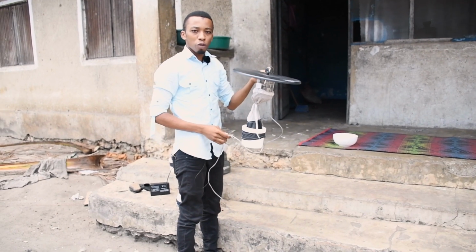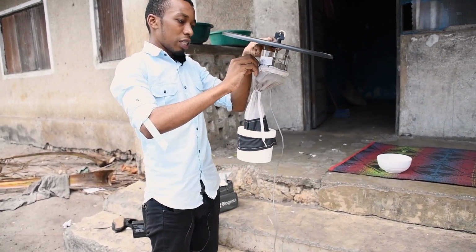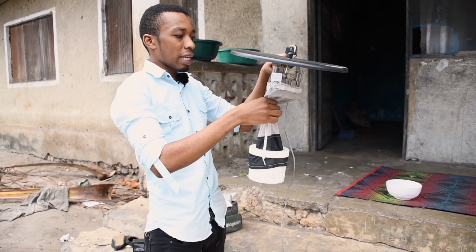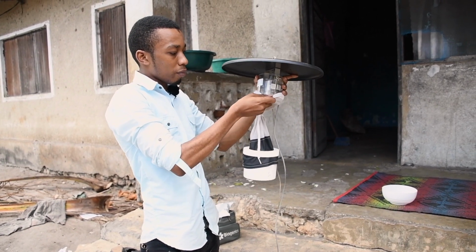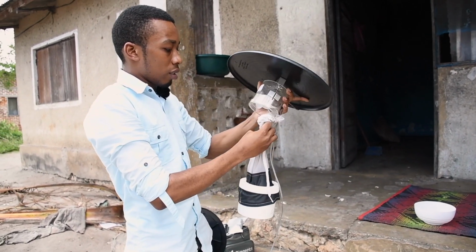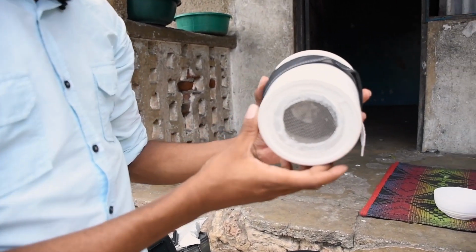So after 12 hours of operation, we're now ready to retrieve the trapped mosquitoes for further procedures. We've tied the net so no mosquitoes can escape, and now we can remove the net from the main part of the light trap, as shown. If you come closer, you can see some mosquitoes. Some are alive and some are dead.